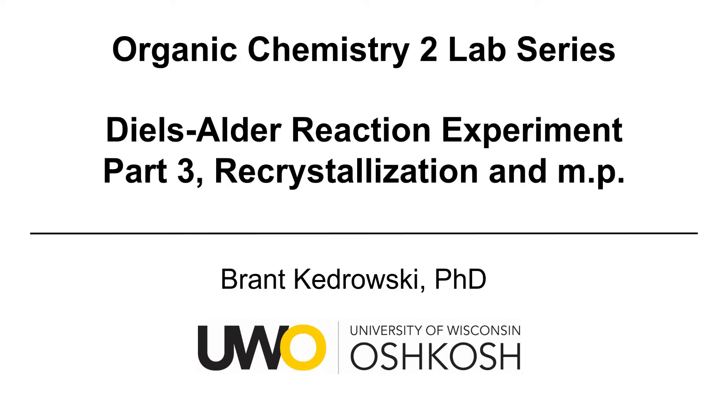In a previous video, I covered setting up a reflux apparatus and carrying out the Diels-Alder reaction, followed by isolating the product. In this video, I'll cover recrystallizing the Diels-Alder product and taking its melting point.